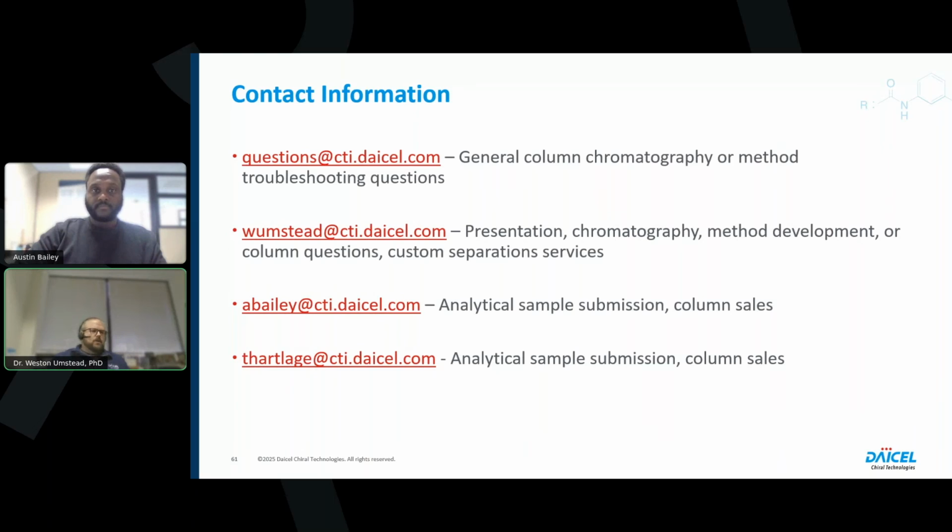So back to the original question. How do you resolve peaks of enantiomers when one is in the positive and the other in the negative for ODH? Gotcha. It would be the same approach. Now, I will say, because you're asking specifically about ODH, there really aren't any foolproof ways of saying, this is how you would separate them.